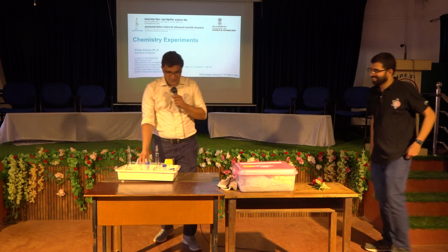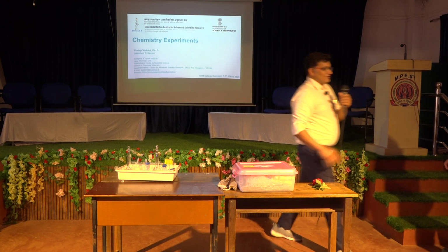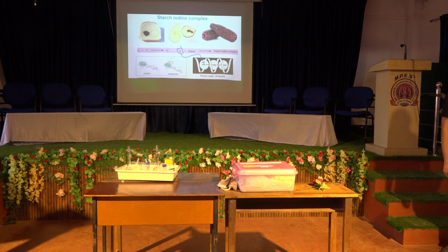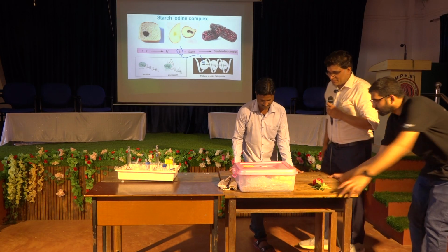Yes, it's working now. Okay, so I have set up a small laboratory to look at some experiments. The reason we are doing this is to learn how to learn chemistry with experiments. So we'll do a few experiments.